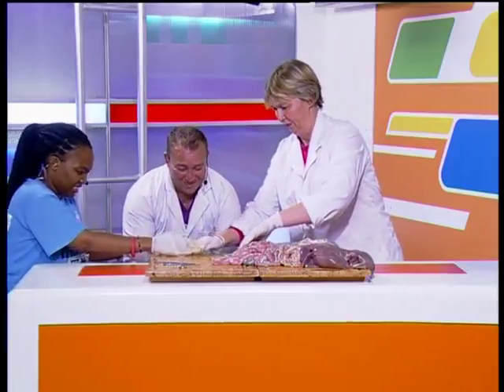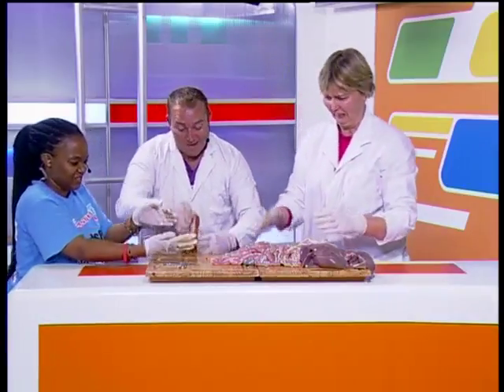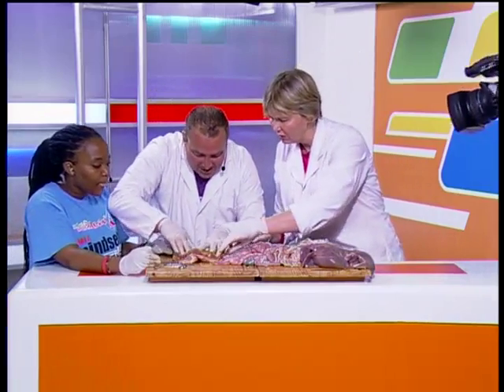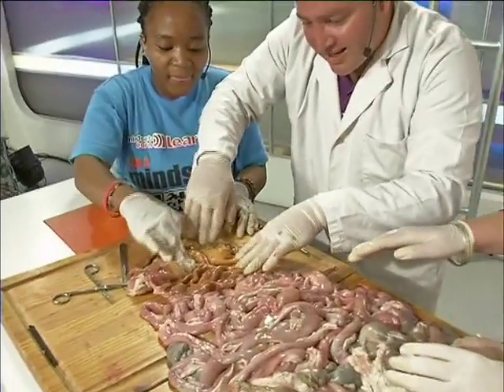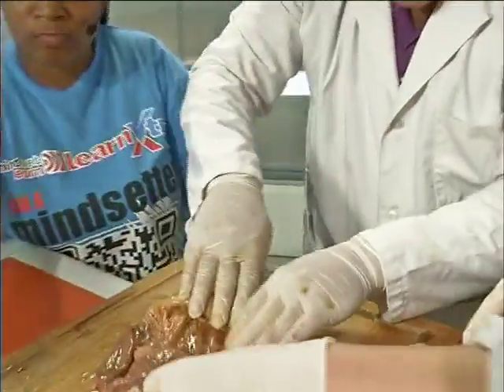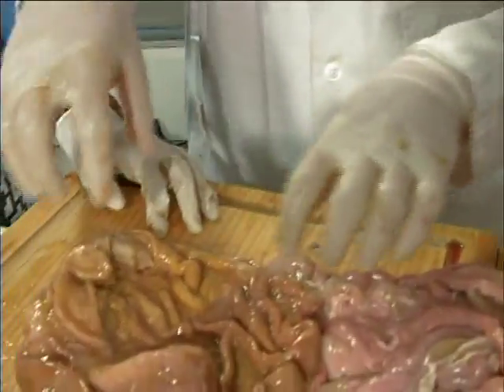Oh, that's a sound. Right, we made sure that we had it messy today. Right, so there's the stomach, okay? And the last thing that it ate, you can have a look. Look how different color it is. The outside is this pinky, nice color. The inside, it's got this yellowy color. Now, that yellowy color isn't actually muscle.